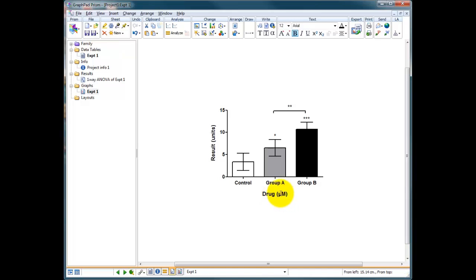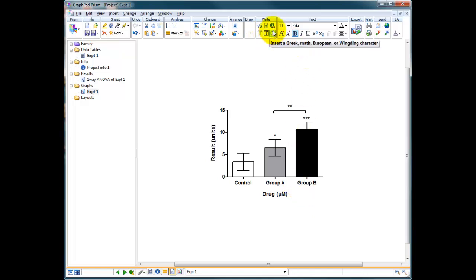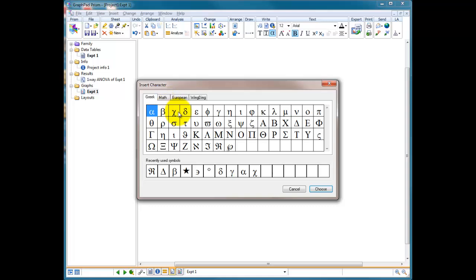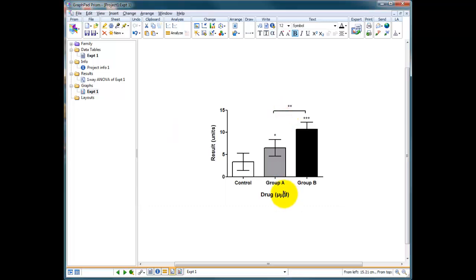Just a little hint, if you didn't know this, to get the micron sign on a PC keyboard you just press the ALT button and then on the number keys on the far right hand side you type 0181. So ALT 0181, release the ALT button and then you get a micron sign. In Prism, you can insert the micron by simply going up to this top menu here where it says write, choosing insert a Greek, math, European or windings character and choosing the micron from here.